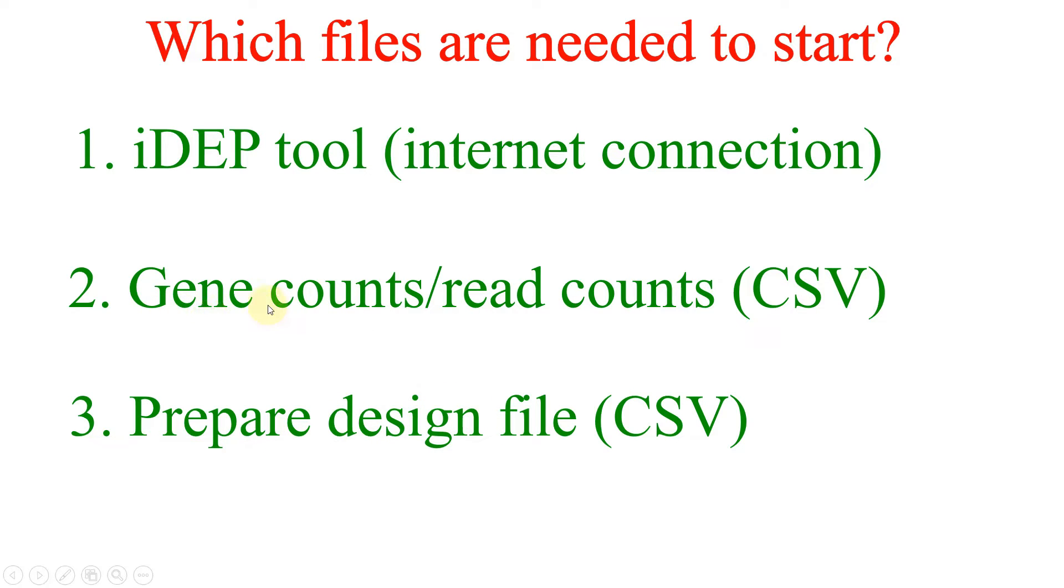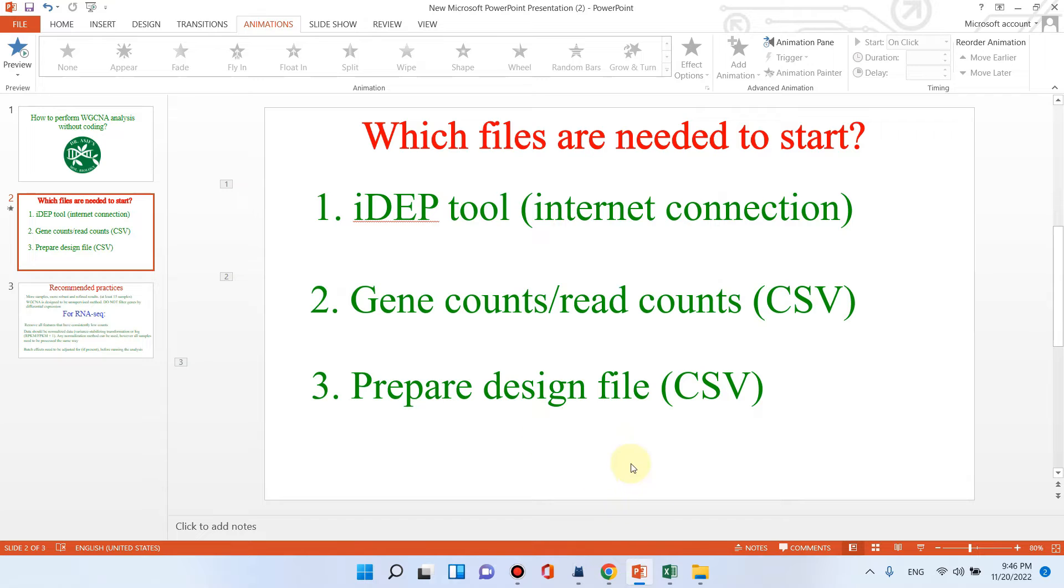I have already prepared this gene counts and design file. Let me show you how you can also prepare your gene counts and design file similarly as I have designed.